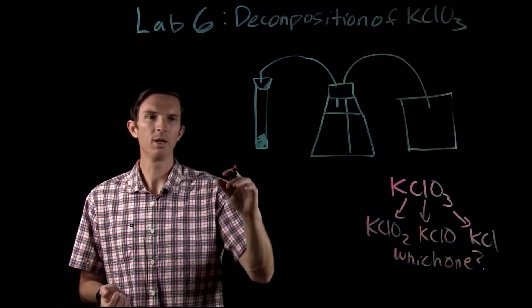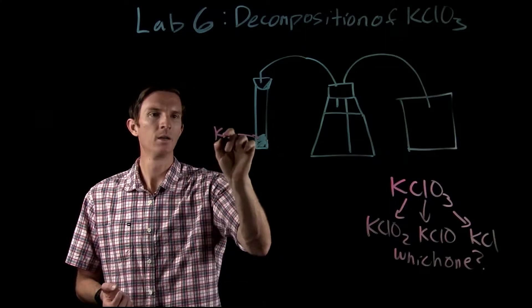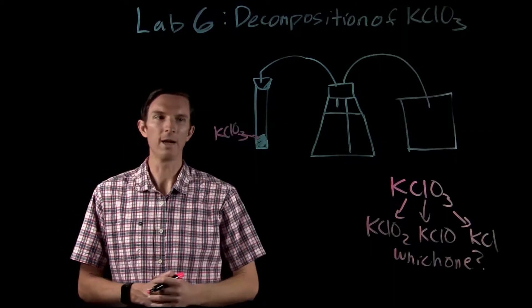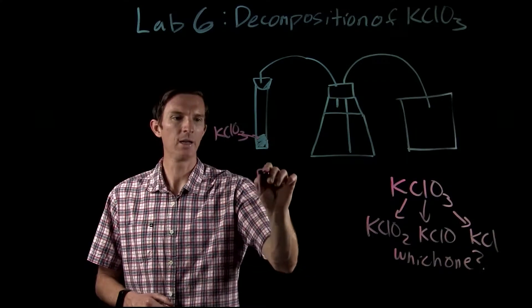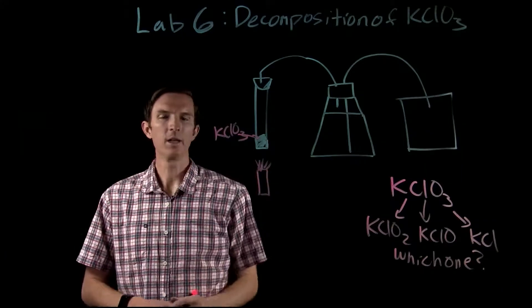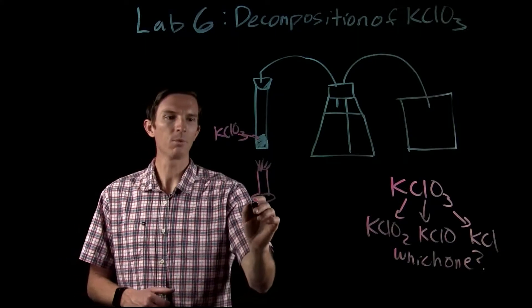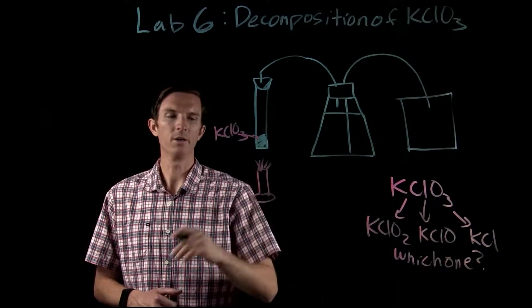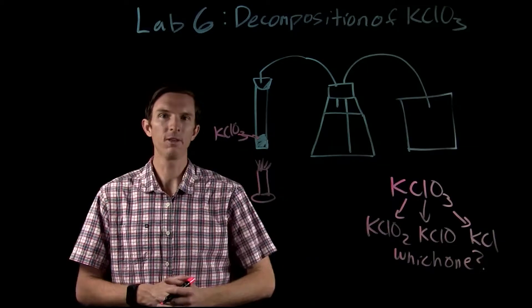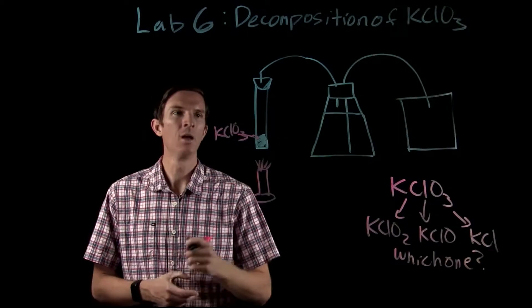In order to do that, we're going to take a sample of our potassium chlorate and get a flame going with our Bunsen burner, heating up our potassium chlorate.